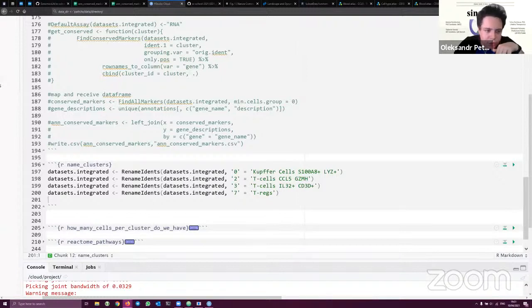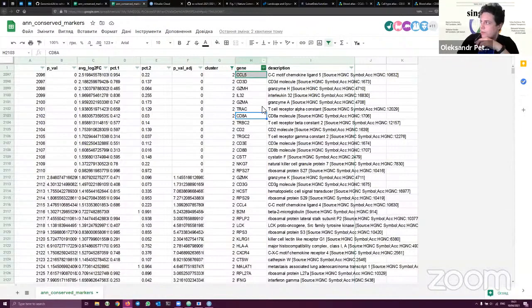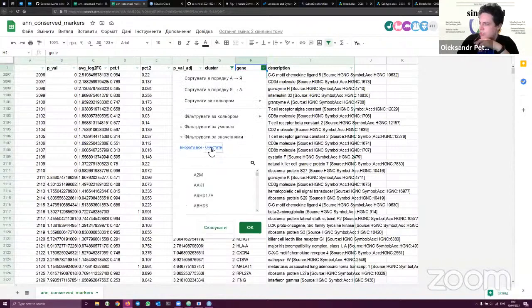Yes, so definitely. Jan writes about help. Yes, for sure. If you tell us what you're struggling with, we will definitely try to help. Yeah. Okay. I got cluster 6, but how do I start identifying? So you filter for, as I showed.